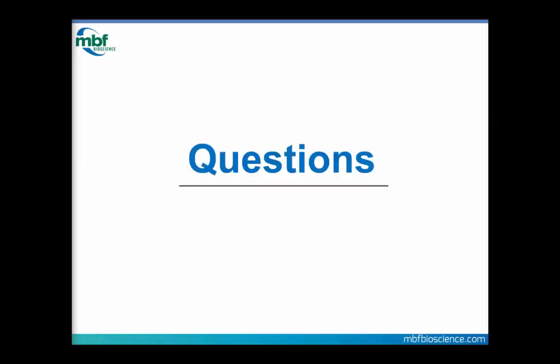So now we're going to pause and answer these maybe more questions about practical things, although we'll answer questions about theory also. Then I'm going to show a couple summary slides, and then I will stick around to answer more questions after.